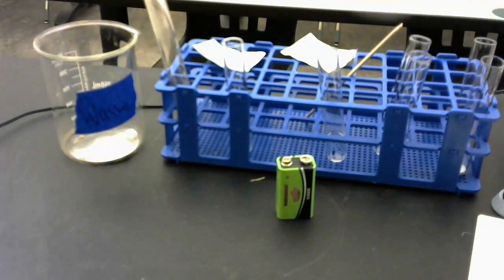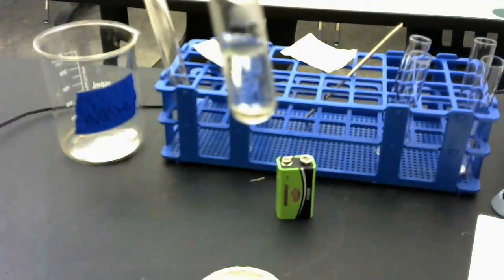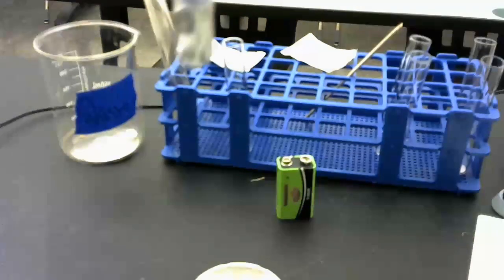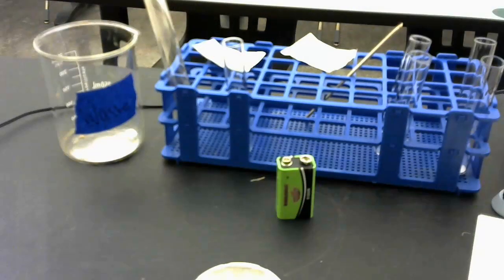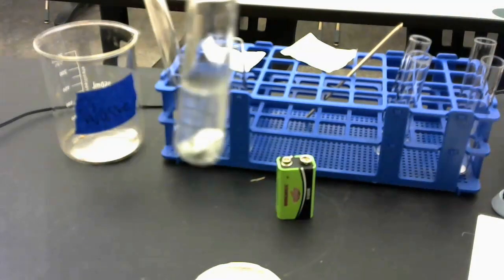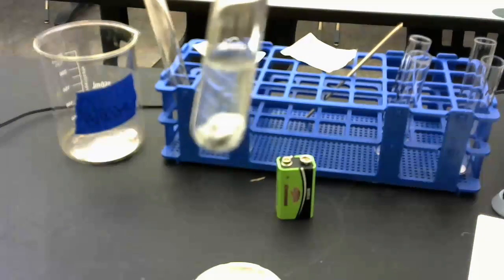And I'm going to take those pieces of zinc, drop them into my test tube, and let them react to the best of their ability. So right here, my zinc was more of a silver color. It looked like a silver metal, okay?